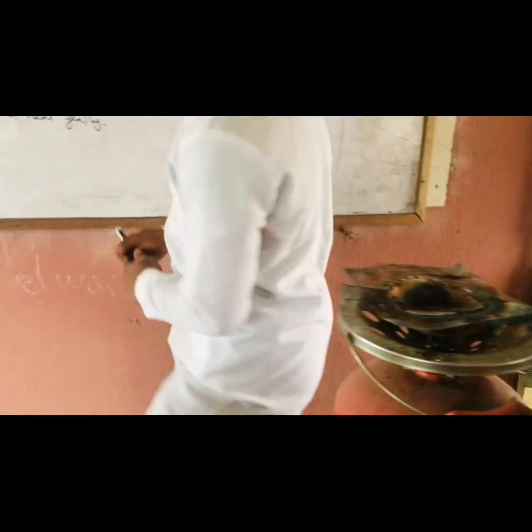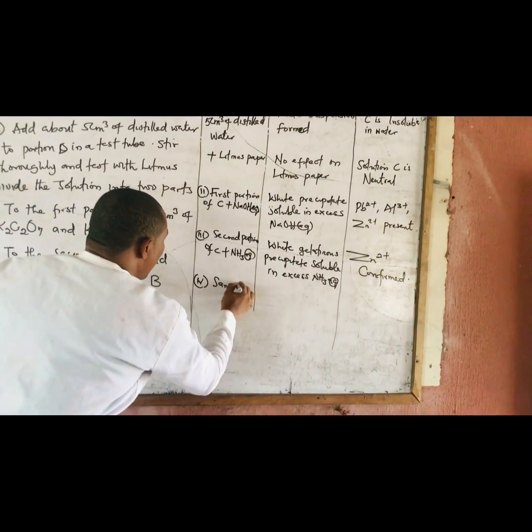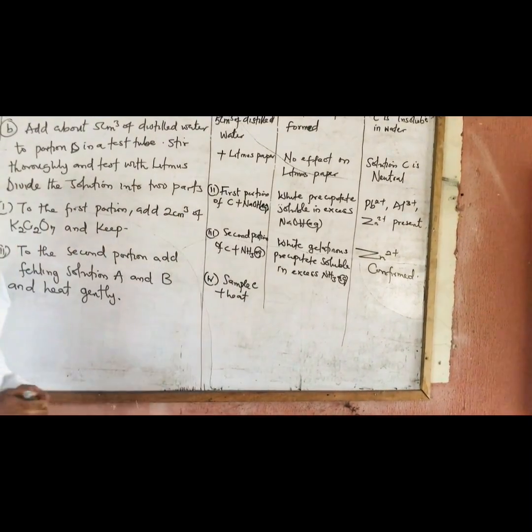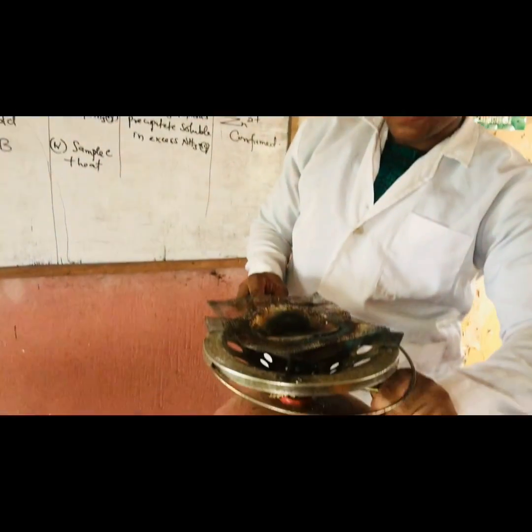So let's just say sample C plus heat, right? Heat it strongly.